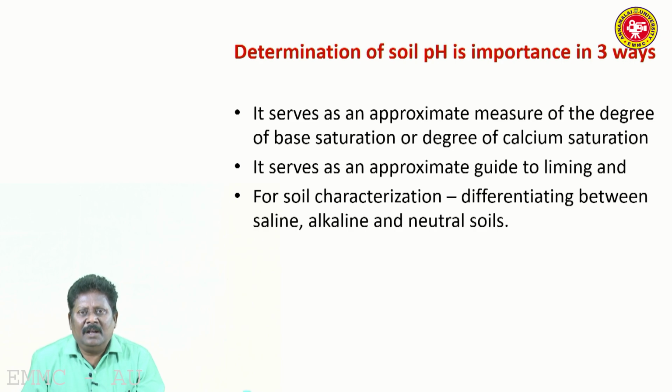Then it is also done to characterize and classify the soil. We have to find out the pH of the soil, a very important parameter. Whether that soil is acidic, alkaline or neutral, we have to find out the pH of the soil. For this reason, the pH estimation is very important.